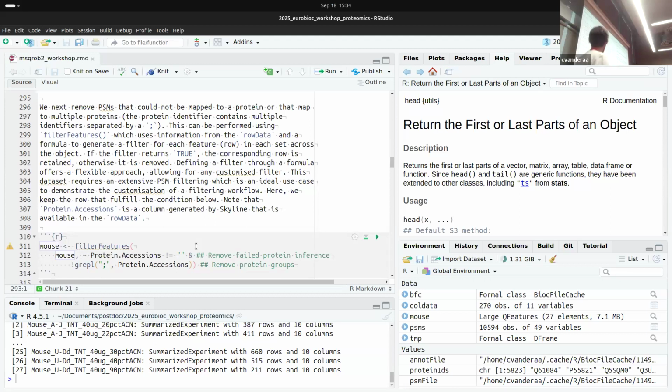So this one, sure, because if you come up with something differentially detected, super interesting, and you cannot map it to the protein. Again, depending on the use case, the researcher will get frustrated saying, yeah, but I want to know what did change, what is the protein that changed. This one, you can still say, no, I don't care. I'm happy to see groups of proteins together, or a peptide changing, but without being sure of which group it changed. This often occurs with isoforms, which have high sequence similarity.